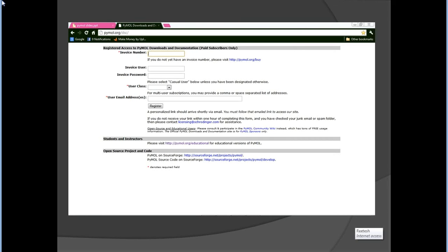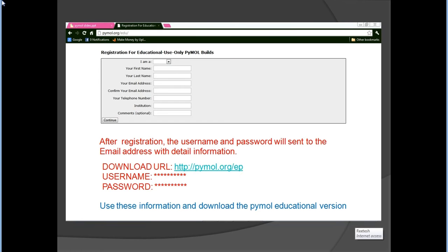Hello friends, today I am here to describe the software PyMOL. First, go to the official website as shown in the slide. You can use an invoice number or your email address to register yourself. After registration, the username and password will be sent to your email address with detailed information. Input all this information and download the PyMOL software — the educational version.